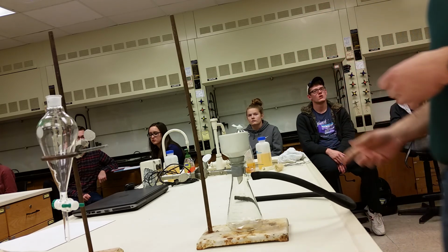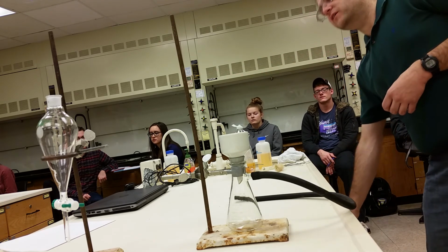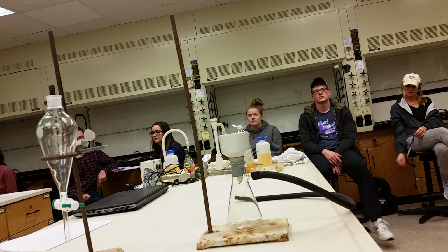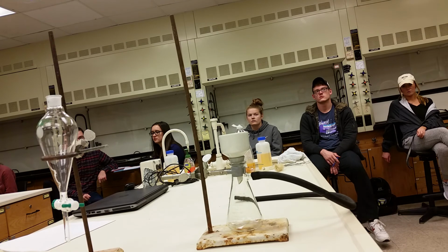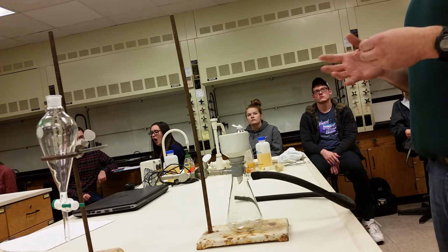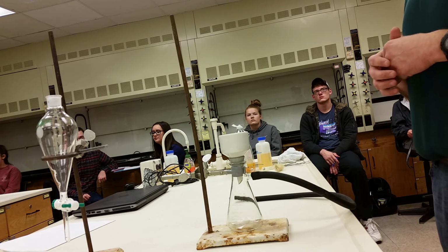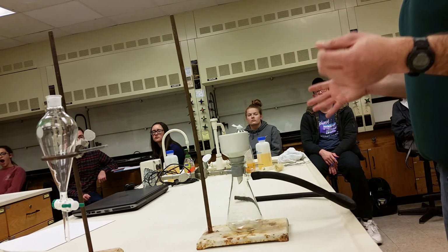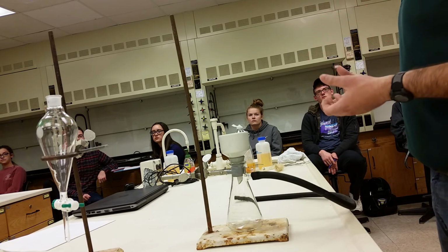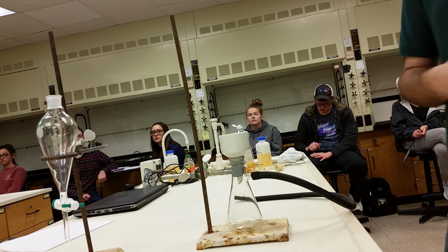You can always grab an extra Buchner if you need to. Set up another one in your hood. We have plenty of material for this. The 327 group, everybody's doing this as an individual's lab, so everybody has to do all of this on their own. But that's because they're going to do a lab practical that's on their own later on.